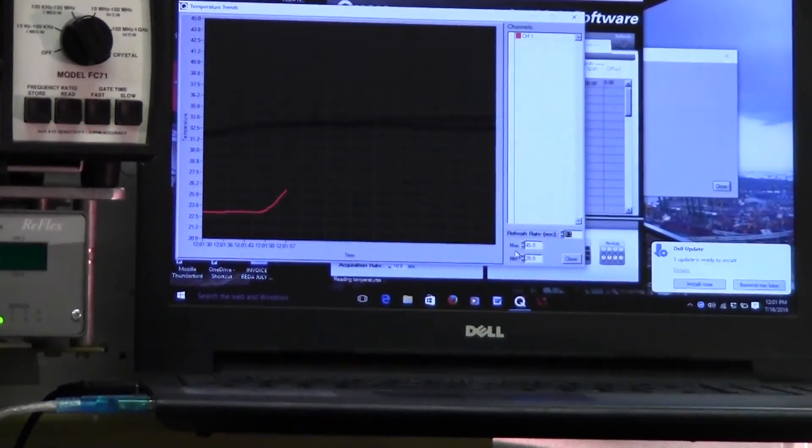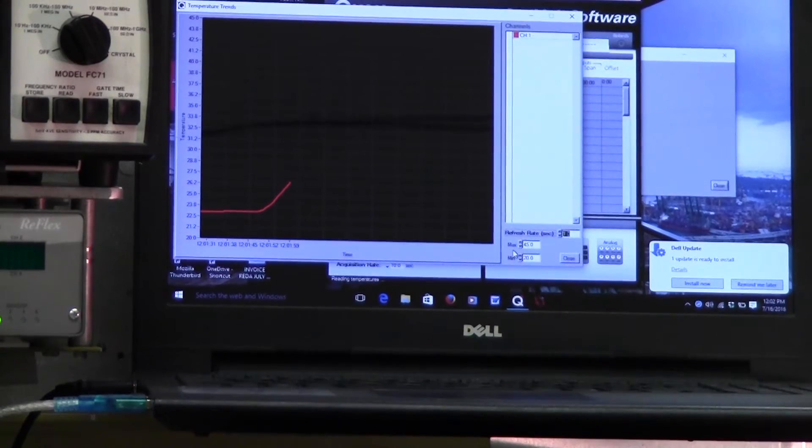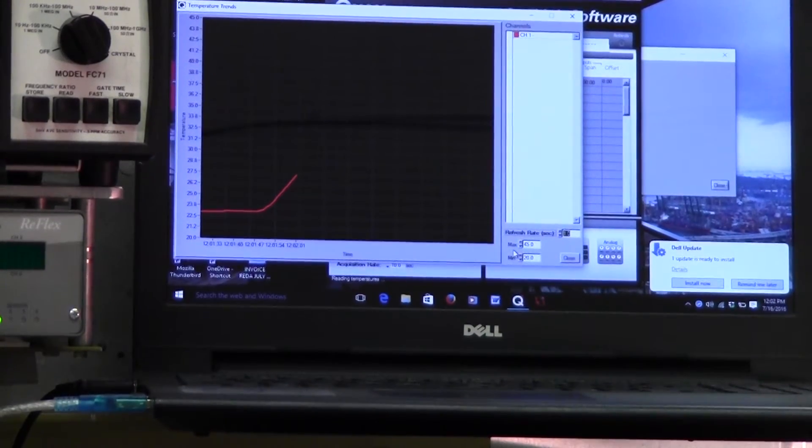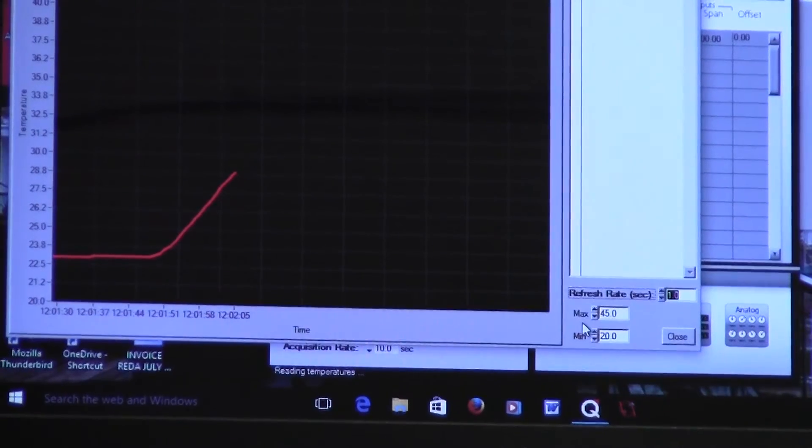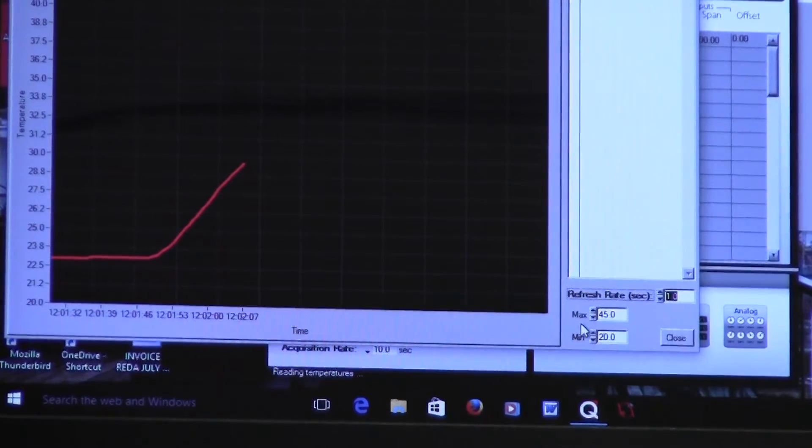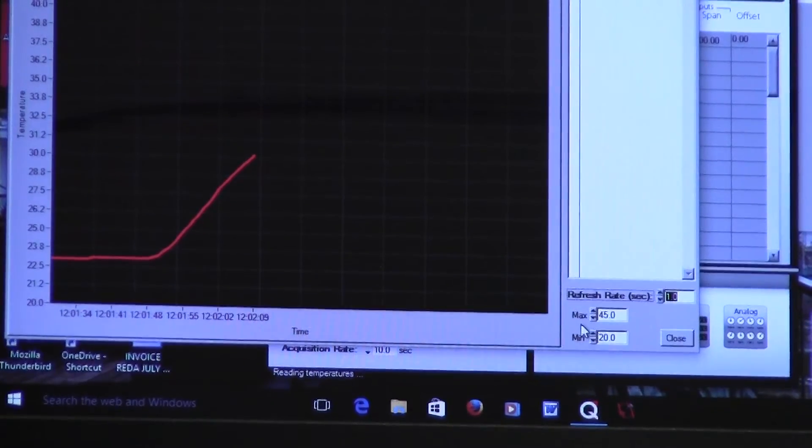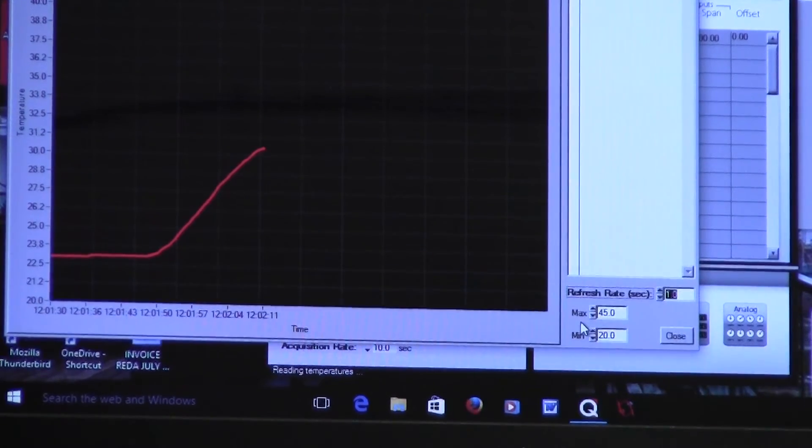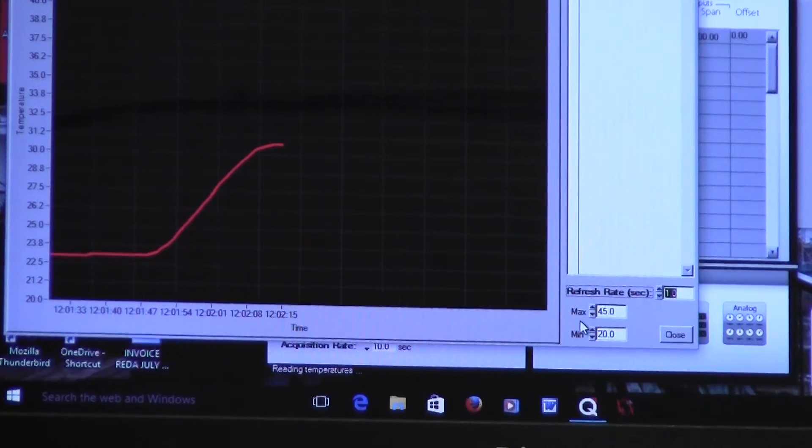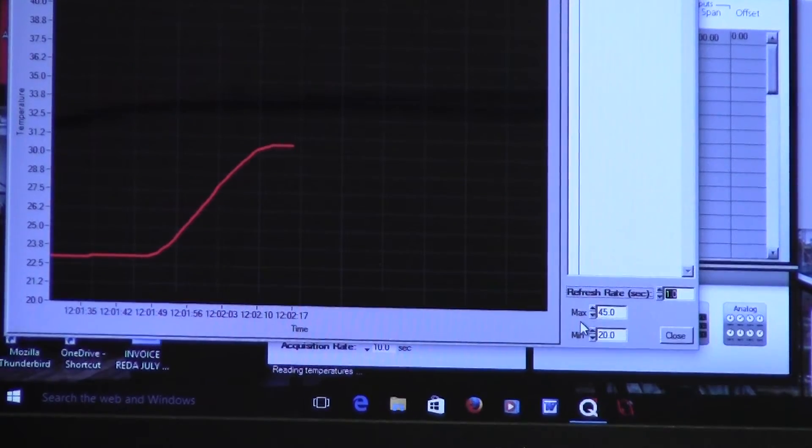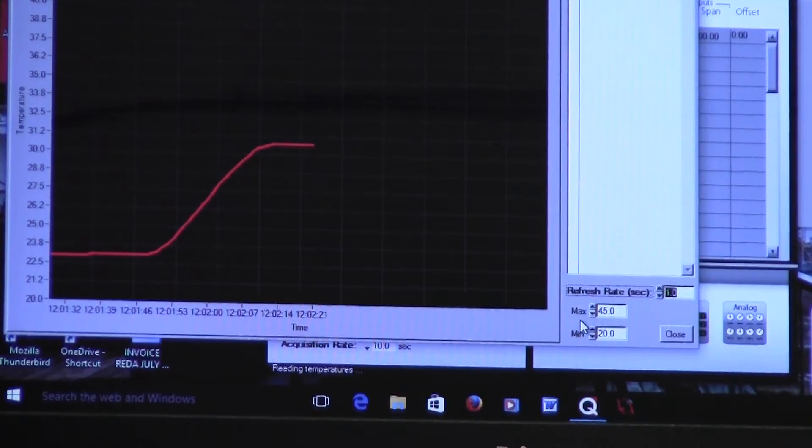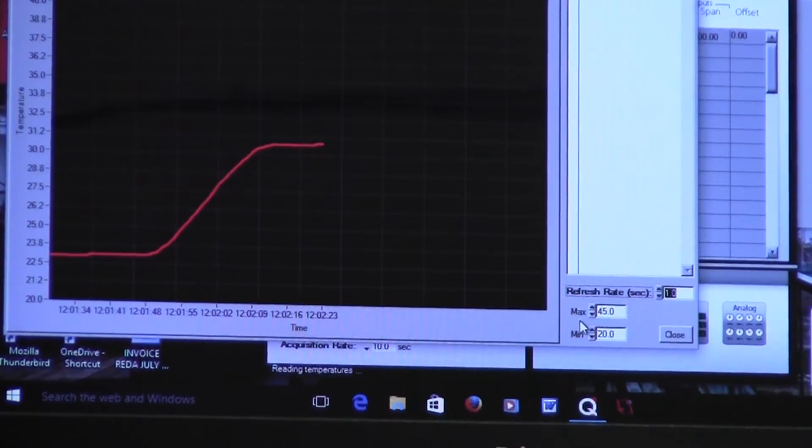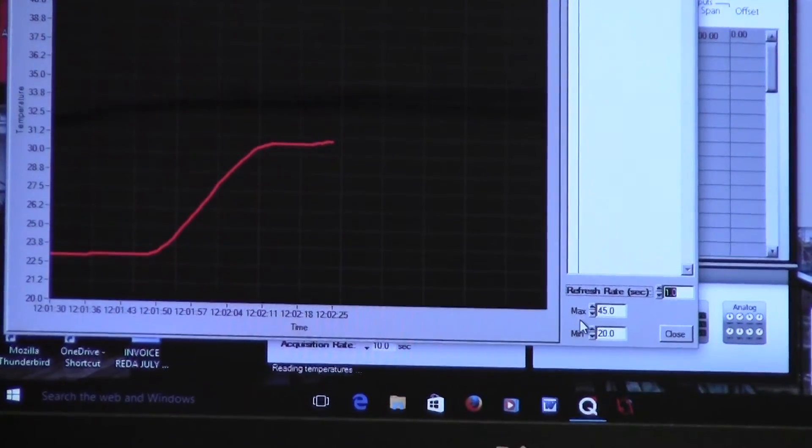We're climbing. We're already, I can tell you, we're at 26 degrees Fahrenheit, centigrade. Now power's coming down as it tries to approach the set point. The curve is bending, as you can see, and we're right where we ought to be. Pretty amazing. If you don't believe me, I'll zoom back out.